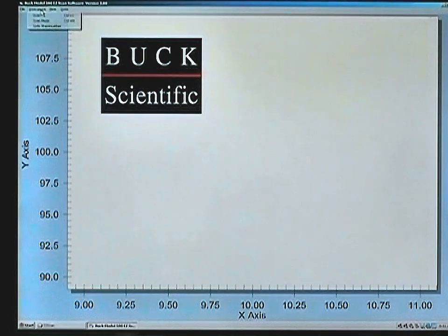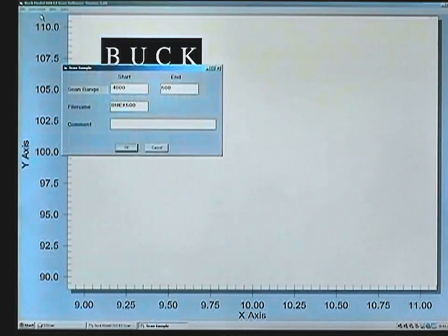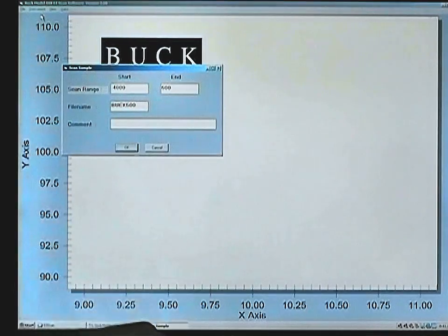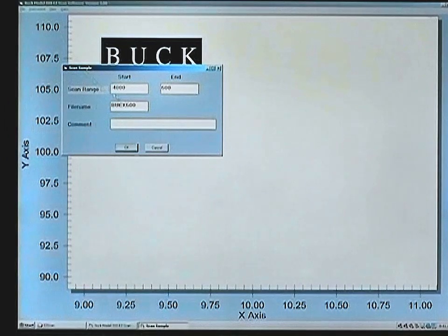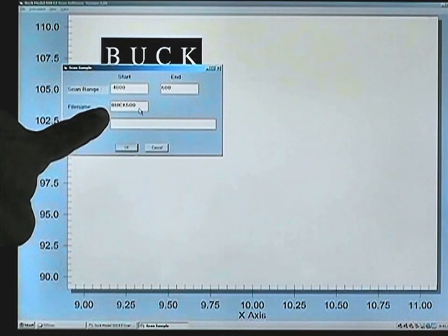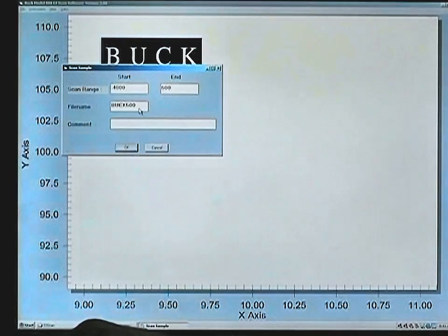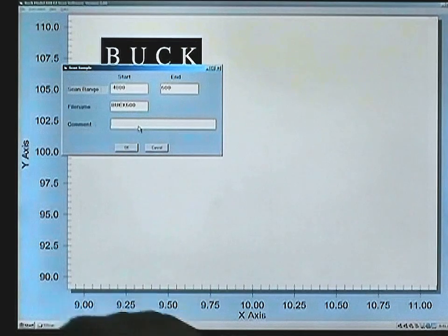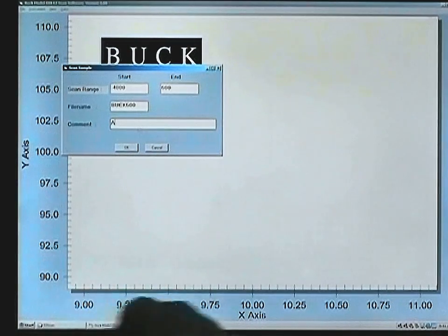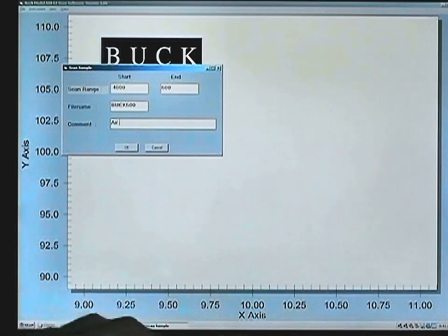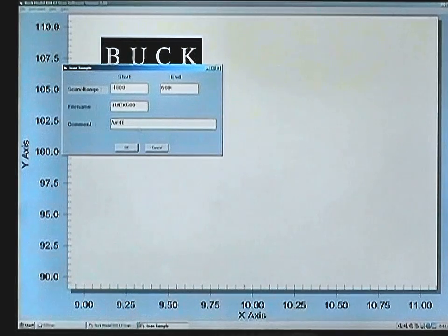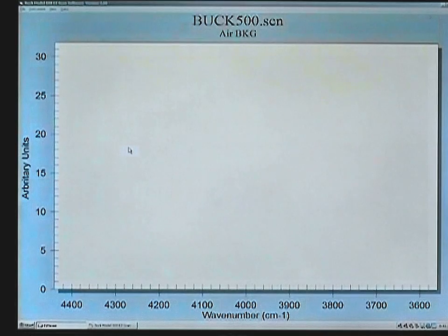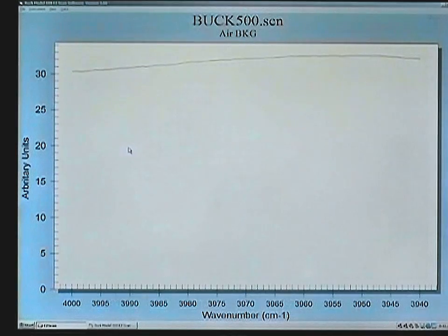We can now go to Instrument, Scan, and the software shows you the setup screen for the first scan. You can use the default file name of Buck 500 or change it to whatever 8-character file you want, and it is recommended to put a reference name in the comment screen. And here we are just calling this the Air Background. We click on OK.